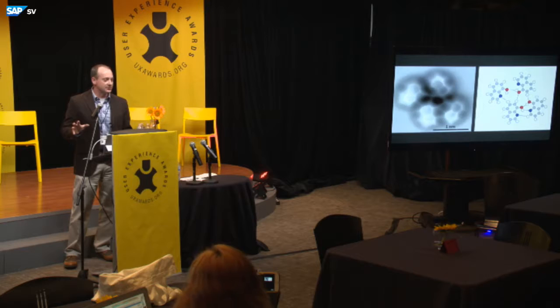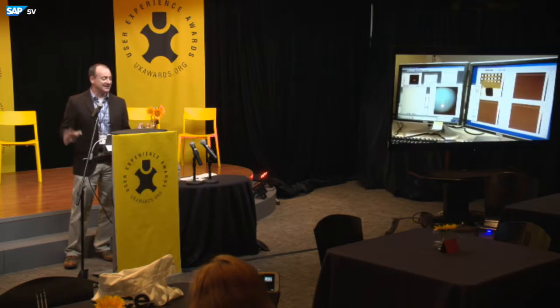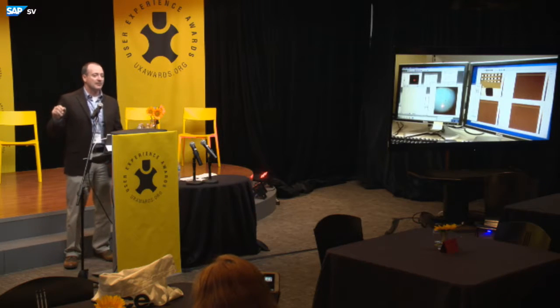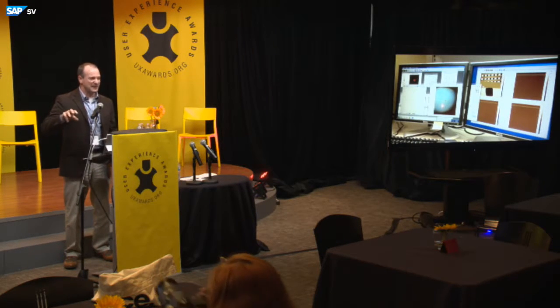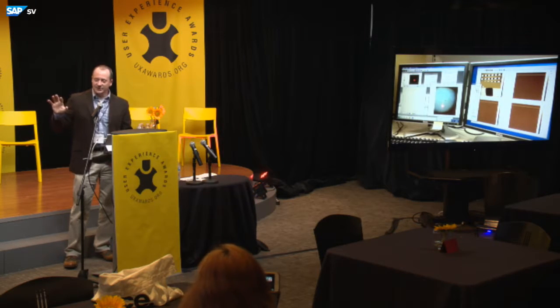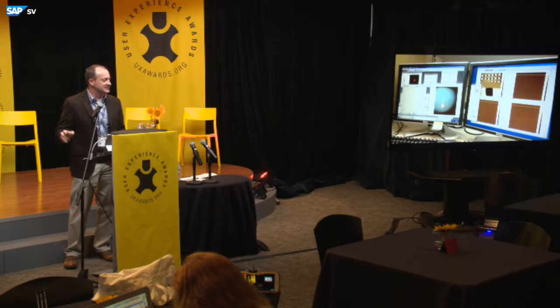What these machines can do is really, really cool, but using them is a nightmare. The software was originally designed by PhD physicists for use by PhD physicists. And when they designed it, it was used by the people who designed it and maybe a couple of other professors, and that was it. And the learning curve to become proficient at using this is incredibly steep. It takes years to master.